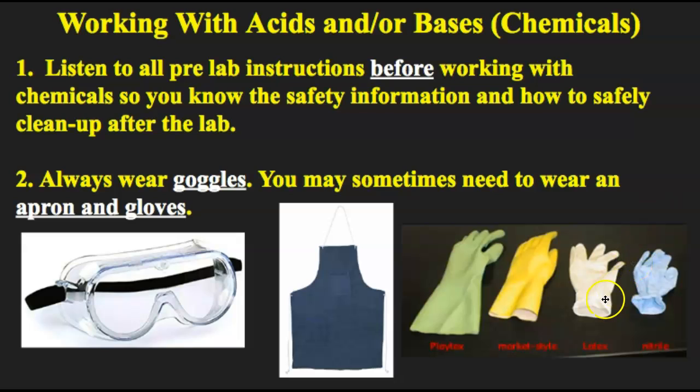Latex gloves — with these you have to be careful because if you buy latex gloves and you have a latex allergy it could cause severe allergic reactions. So make sure you know whether or not you're allergic to latex if you buy gloves for home use. And then there are nitrile gloves, which are very good at resisting most chemicals. You always want to check out what the chemical recommends for you to use for gloves.